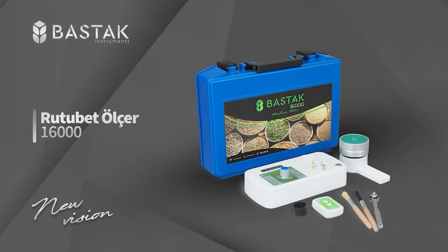The Bastak brand 16,000 model moisture measuring device is used to determine the moisture content in cereals, oilseeds, legumes, flour samples, and feed samples.